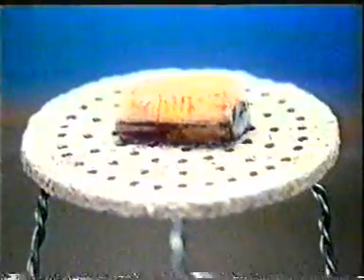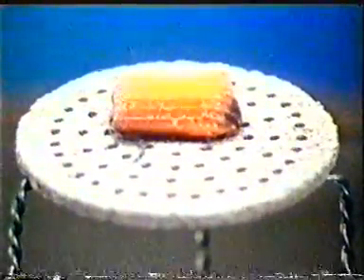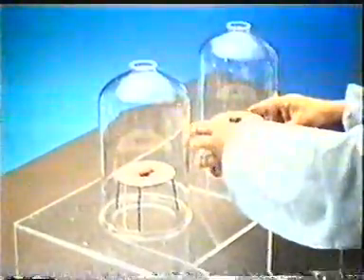This piece of charcoal is burning, and so is this one. What would happen if the charcoal were burned in an atmosphere containing more oxygen than ordinary air? The two pieces of charcoal are each covered with glass bell jars.